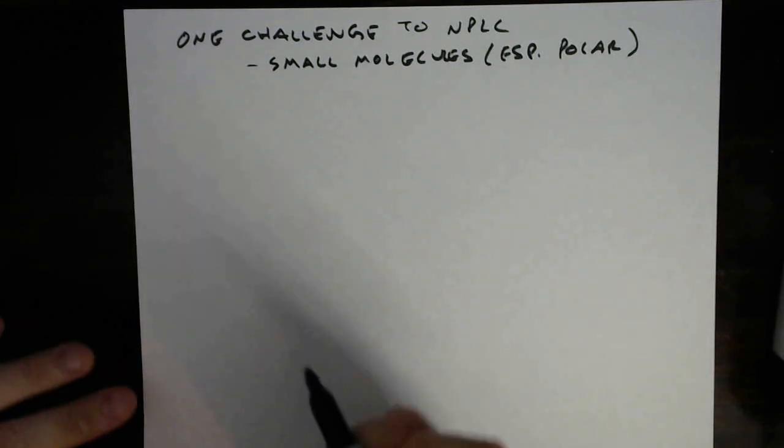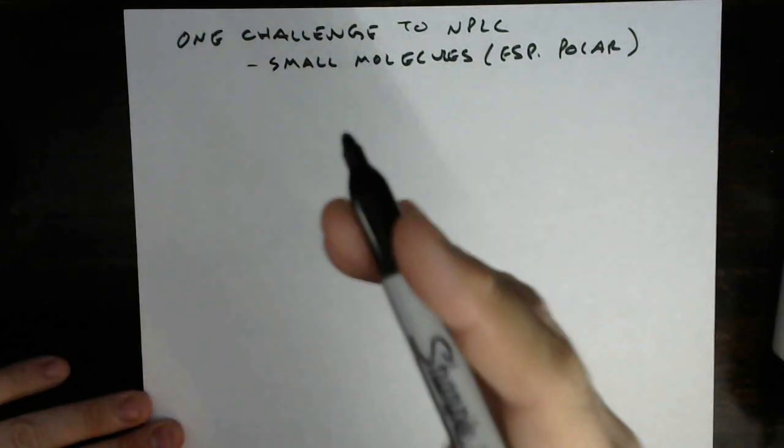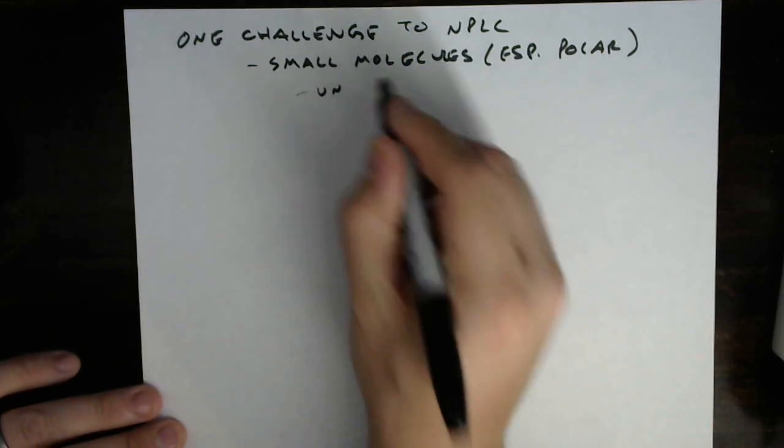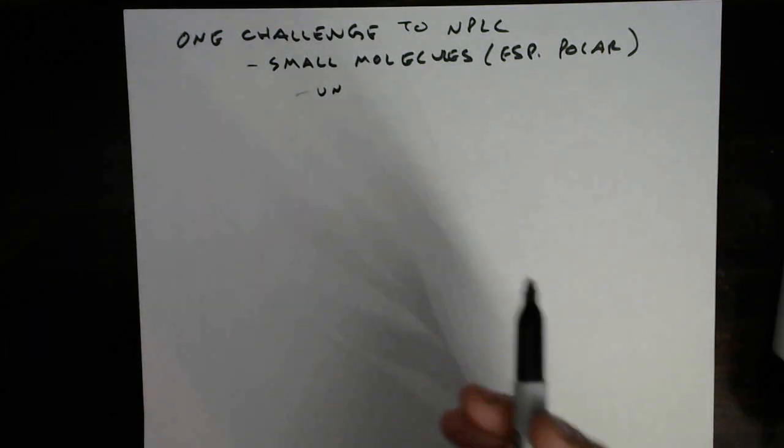There's a couple reasons for this. Small molecules don't have a lot of steric hindrance to get down to the underivatized surface, right? So if we get 25 to 50% yield, I'm talking about the other 75 to 50%, right?